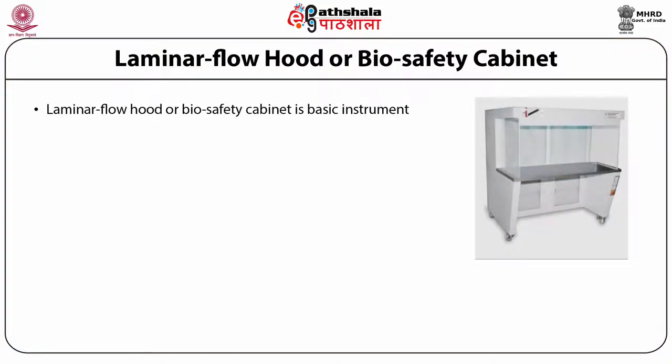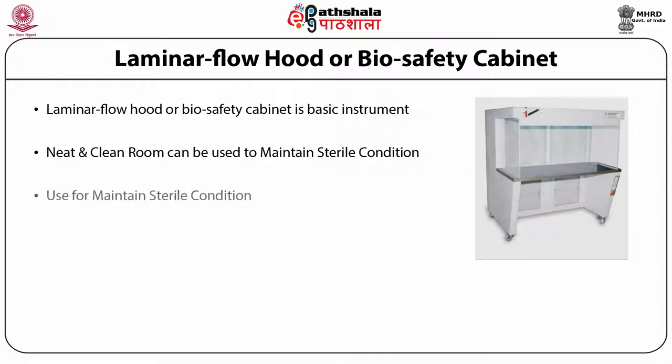Laminar airflow or biosafety cabinet. Initially, when instruments were not available, a single room with a neat and clean environment may have been used, maintaining sterile conditions by putting up some lamps or candles, and a small environment may have been created to produce the sterile condition for maintaining animal cell culture. But nowadays, laminar airflow or biosafety cabinets are available for this purpose. They maintain the sterility of the environment.